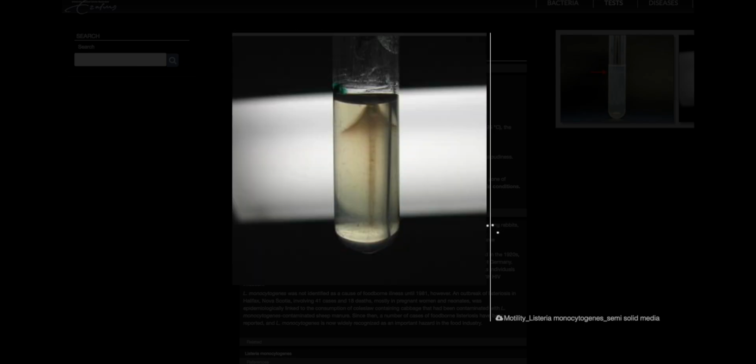The agar is stabbed with a needle containing the bacteria. At 20 to 28 degrees Celsius, Listeria monocytogenes inoculated into the agar column will swarm through the medium, producing a cloudiness that is easily visible to the naked eye. A layer of increased growth is typically observed about 0.5 centimeters below the agar surface, where oxygen tension is reduced, indicating that Listeria monocytogenes thrives in microaerophilic conditions.